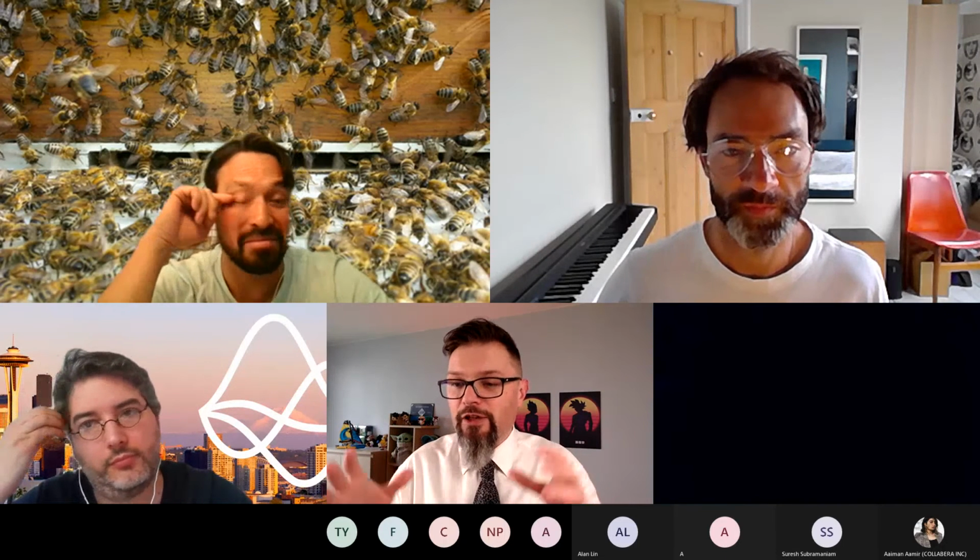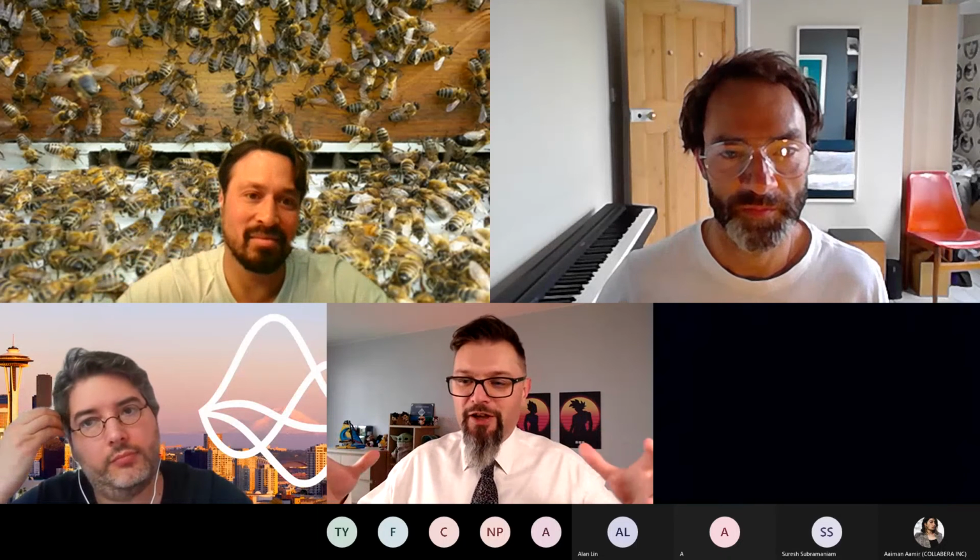And my part is IoT, and here it's an IoT project, just to have a connected microscope to make all the automation, and the laboratory technician just puts the lamella under the microscope, and on the outside, on his mobile phone or whatever, he just has the score. So having more real-world examples, implementing stacking, because we know that it's a real bias that we have, and then automating, connecting a microscope and automating the image collection.